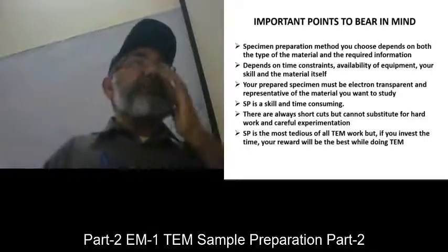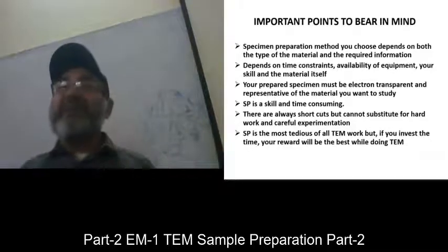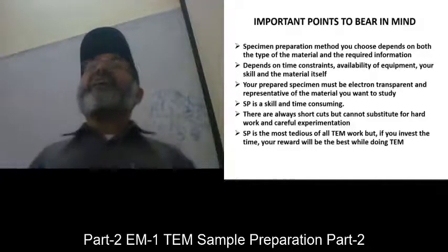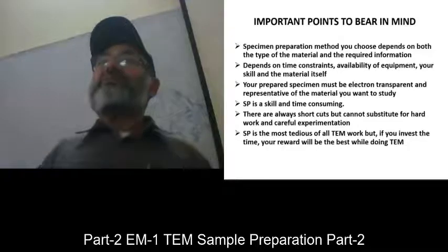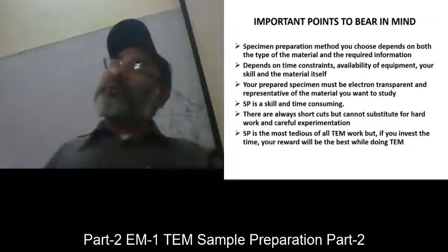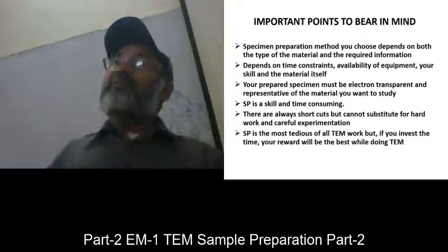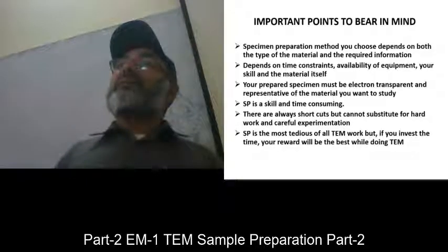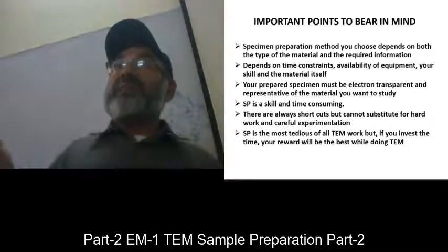This is the way of describing a scientific result, because the EDS is not informative enough to tell you the exact composition, because there are chances of contribution from other areas.